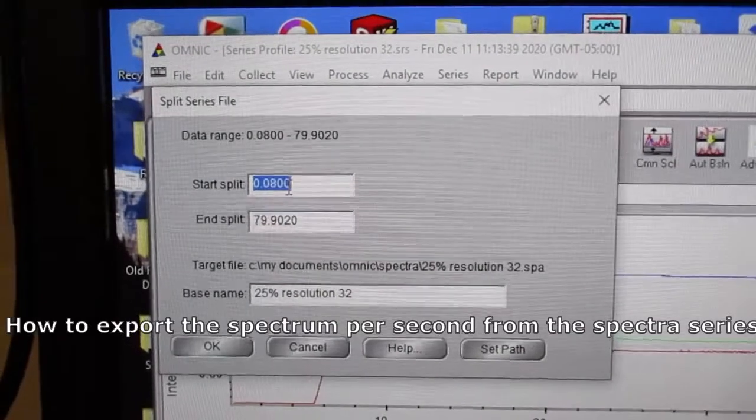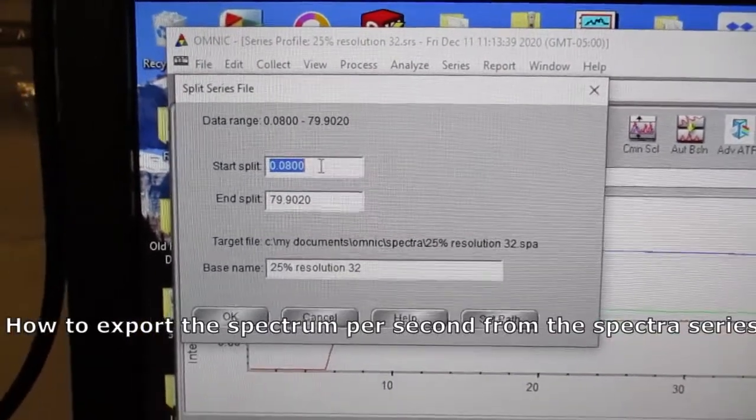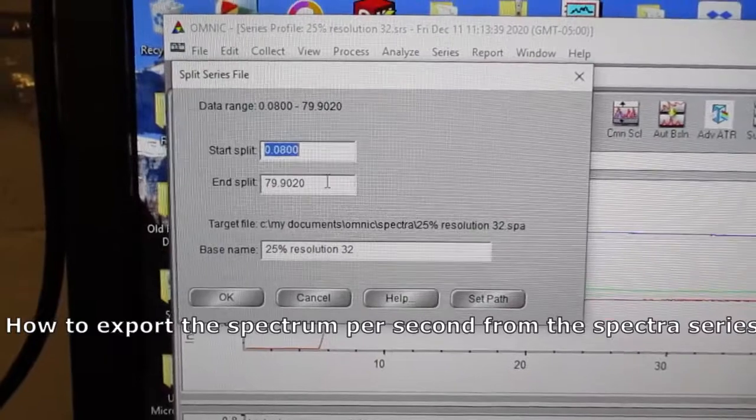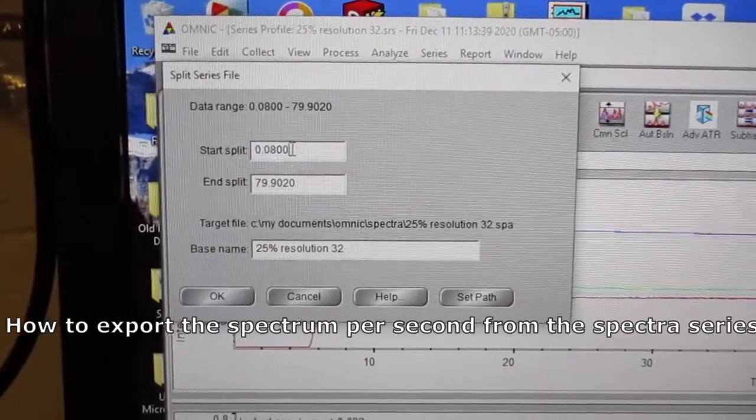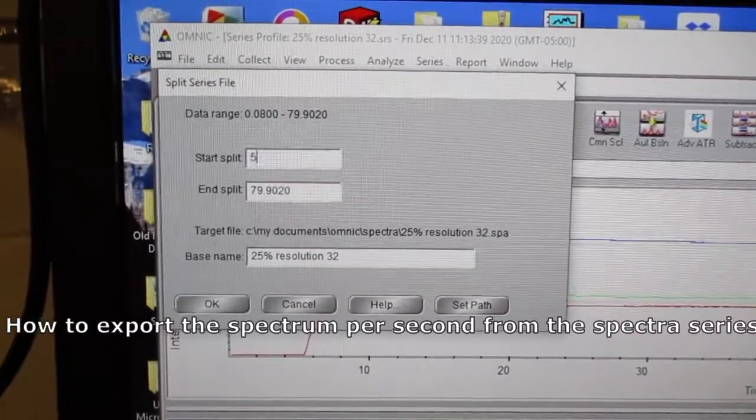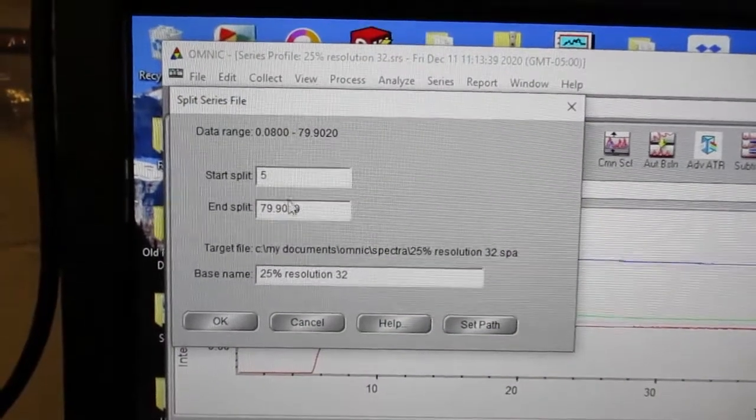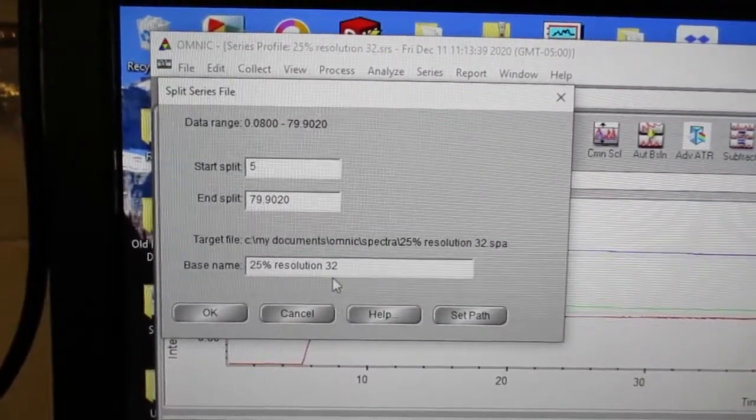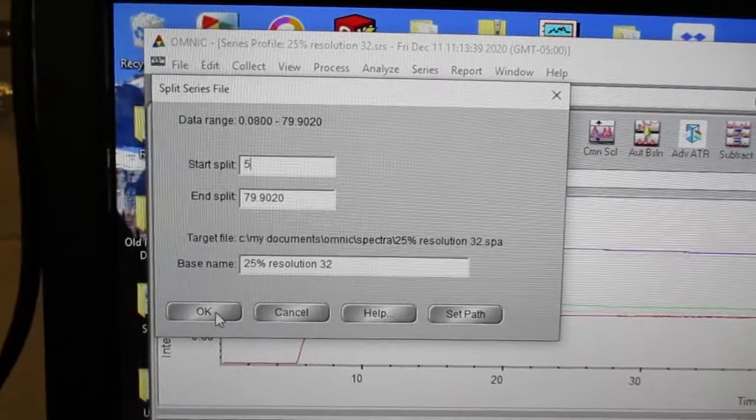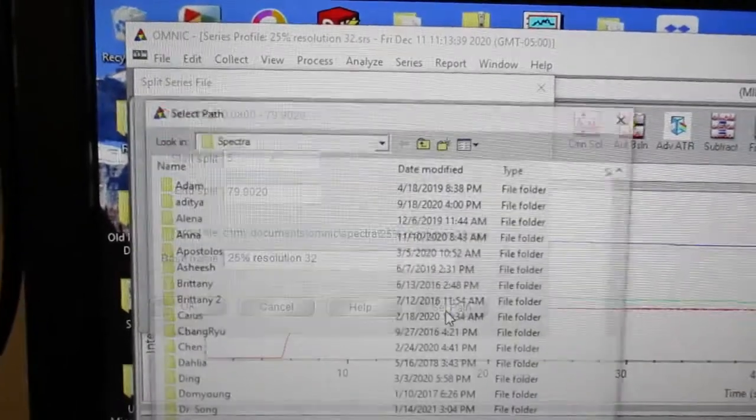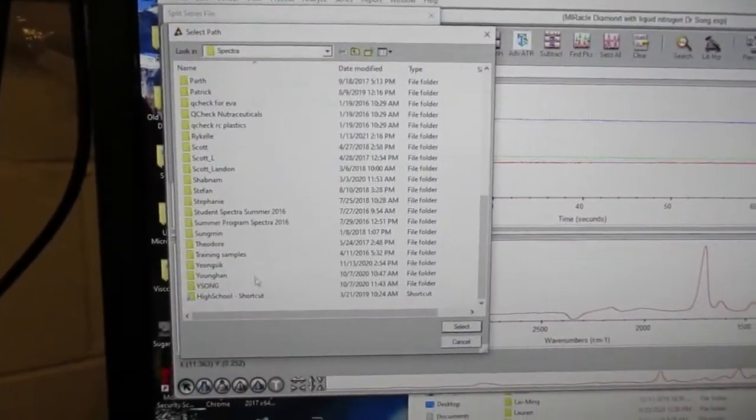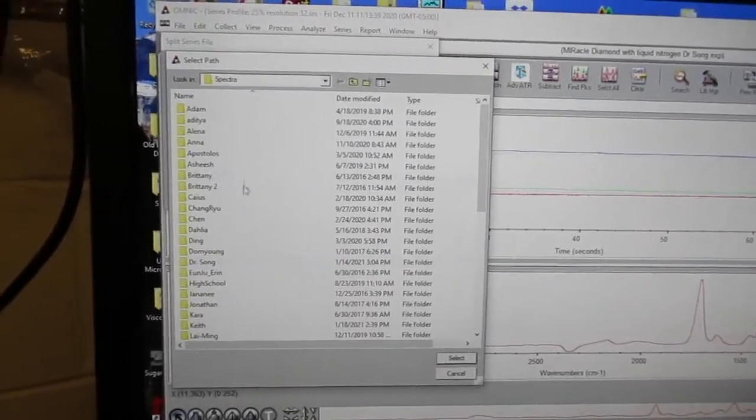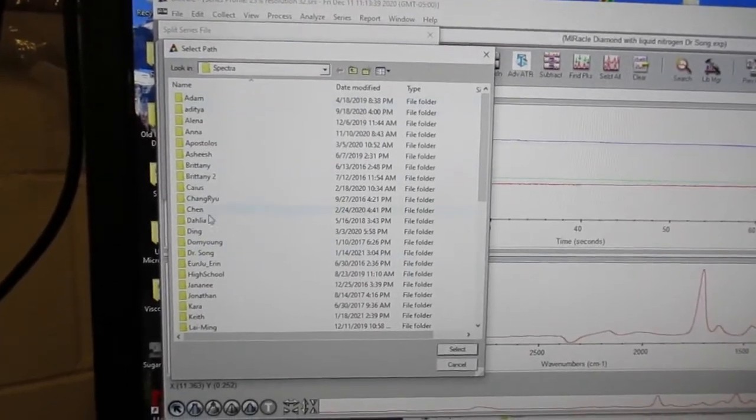You can set what time you want it to start at and what time you want it to end at. Typically we like to do five seconds because that's when we actually start. Then you want to set the path, because otherwise it's just going to save in default and spectra is just going to be a mess.